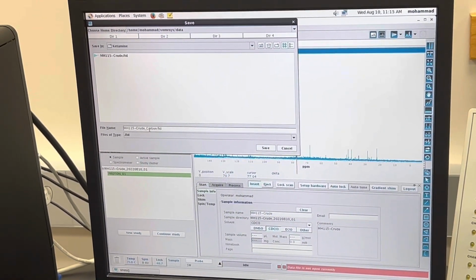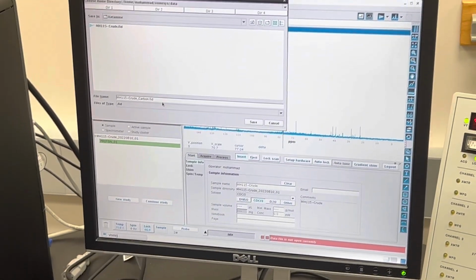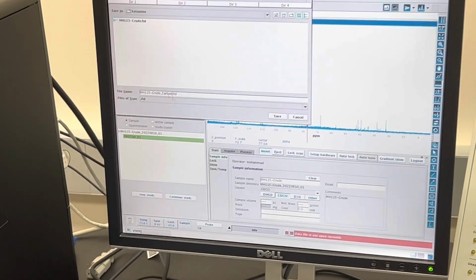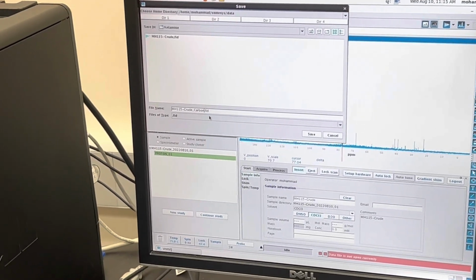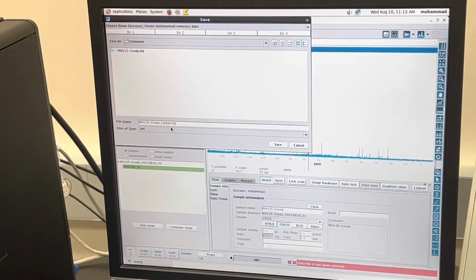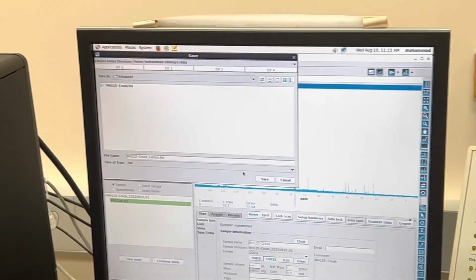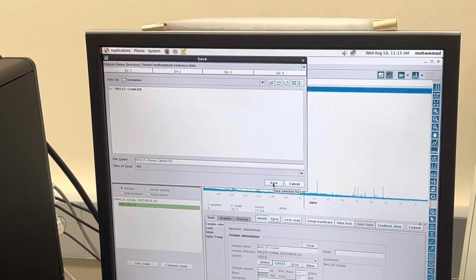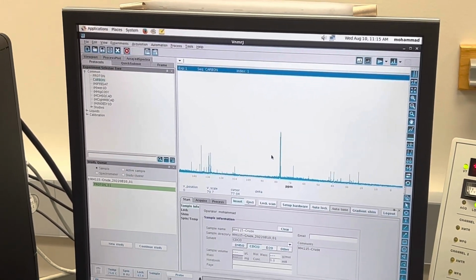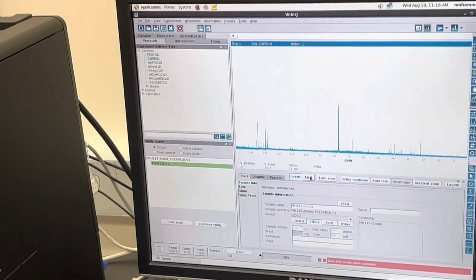And if I remember correctly, we cannot use any spaces here. No spaces. You can use underscore, period, and dash. But don't use a star or question mark, no special characters, because Unix may treat them as special for coding. Just use normal characters.